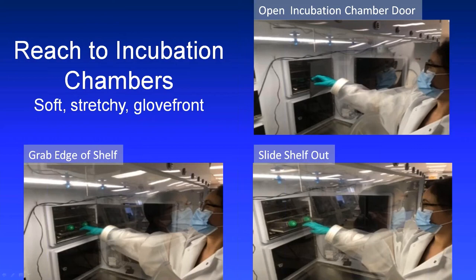So, this particular glove front has been in continuous use for 7 years. So don't be afraid to push into that glove front and to reach things. It can accommodate that. Go ahead and give it a shot. Don't be shy with the glove front.